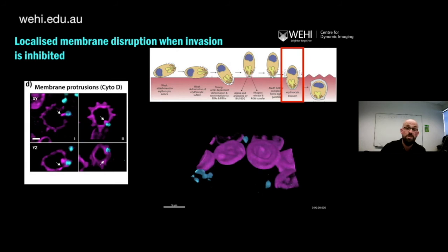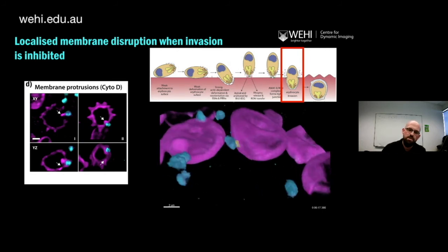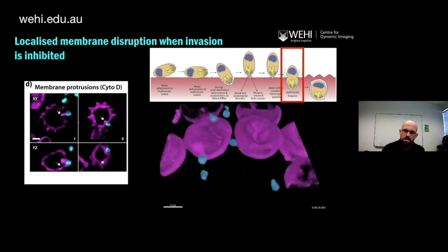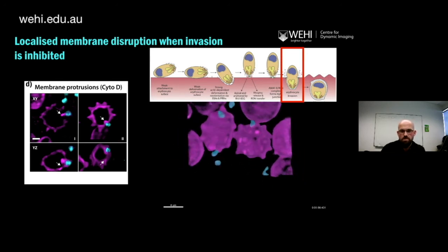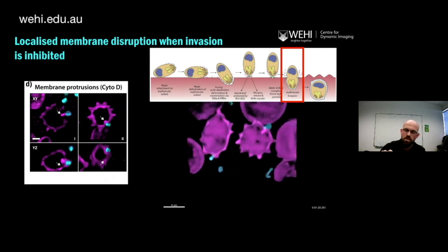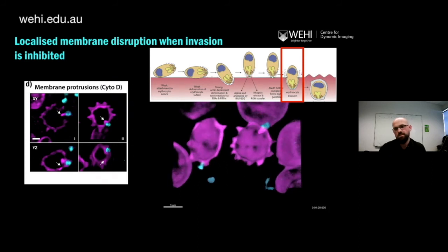When we inhibit with cytochalasin D, we see a similar structure, but it's now on the cellular side of the membrane. This is because when we inhibit it, at this point, the tight junction is still formed, so it's able to form irreversible attachment. As we zoom in, we see it's formed this quite large protrusion to the cell as it's depositing its content into that membrane.